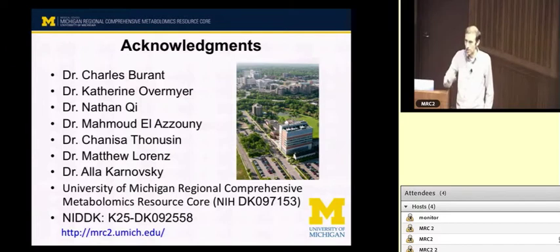You'd see the variability in the metabolome, but you may still be able to detect your biological effect. If you had a 1.5-fold change from isoflurane anesthesia, and you had a 3-fold change due to what you actually wanted to study, probably that disruption in the metabolome would still be there.